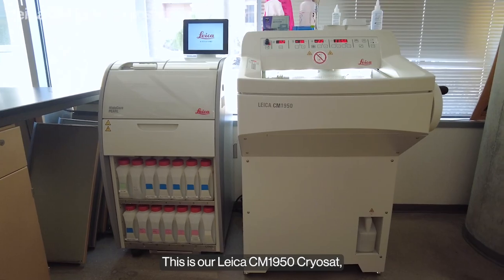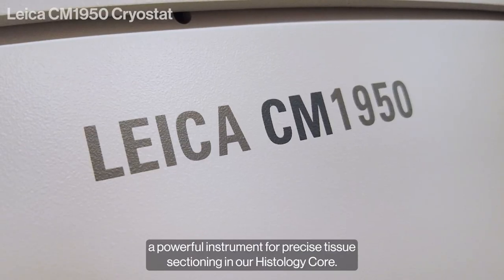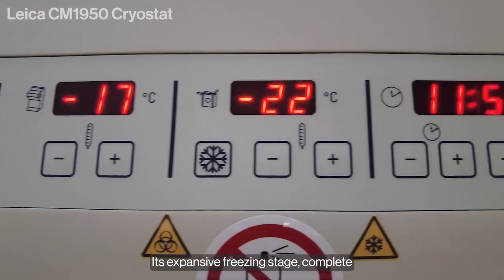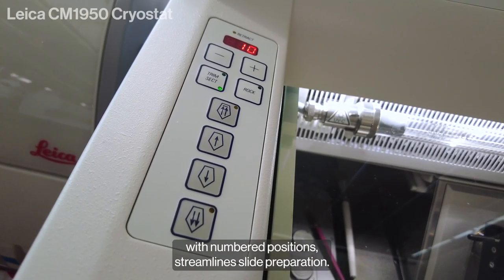This is our Leica CM1950 Cryostat, a powerful instrument for precise tissue sectioning in our histology core. Its expansive freezing stage, complete with numbered positions, streamlines slide preparation.